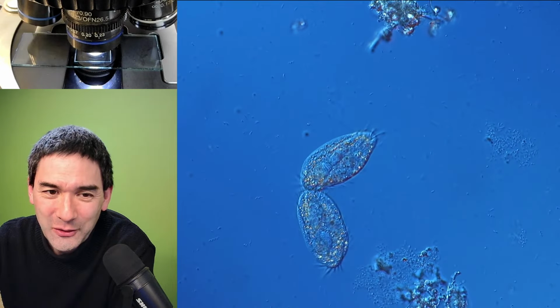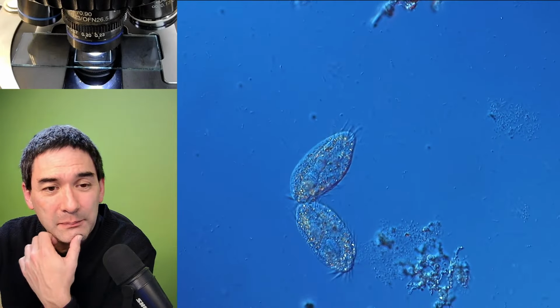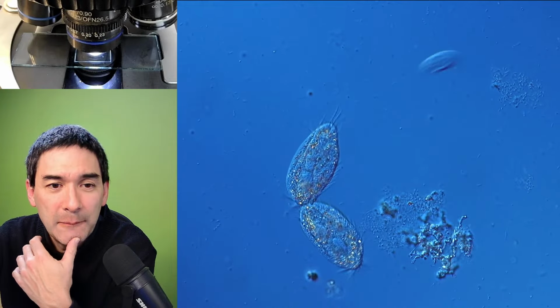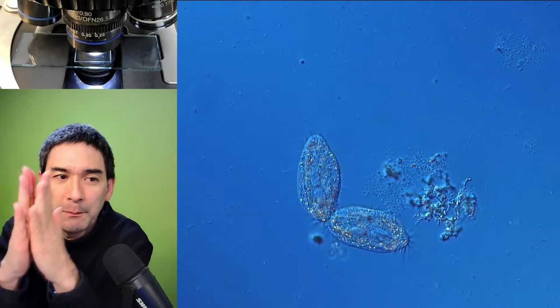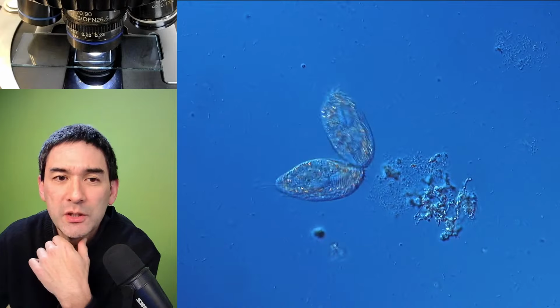They're almost separated now. What you can sometimes see is the following. This is now cell division, obviously, but sometimes they will also conjugate, and conjugate means that they are exchanging DNA. They line up in parallel with each other, and then they exchange DNA. What's your previous question?